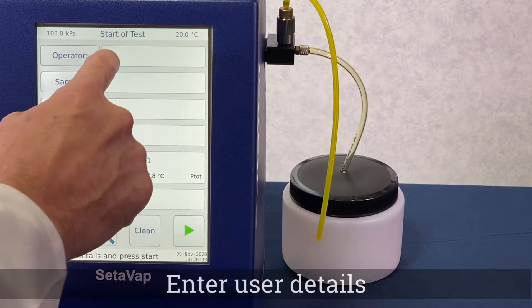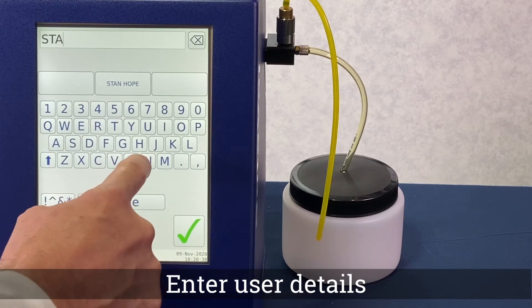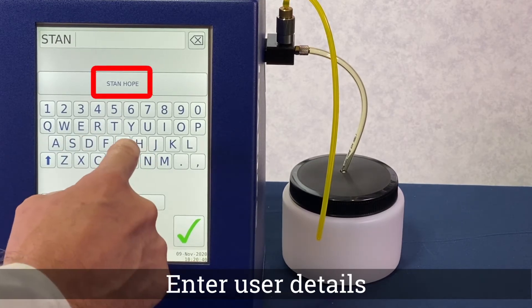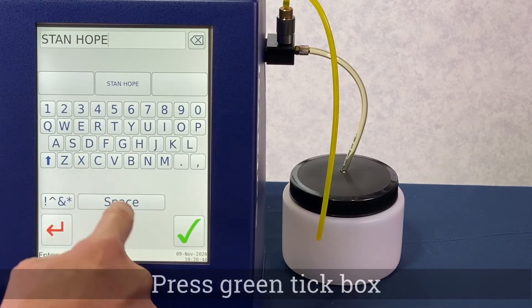With the instrument turned on, select the operator field and enter the user details. Frequent users will automatically appear and can be selected. Press the green tick to proceed.